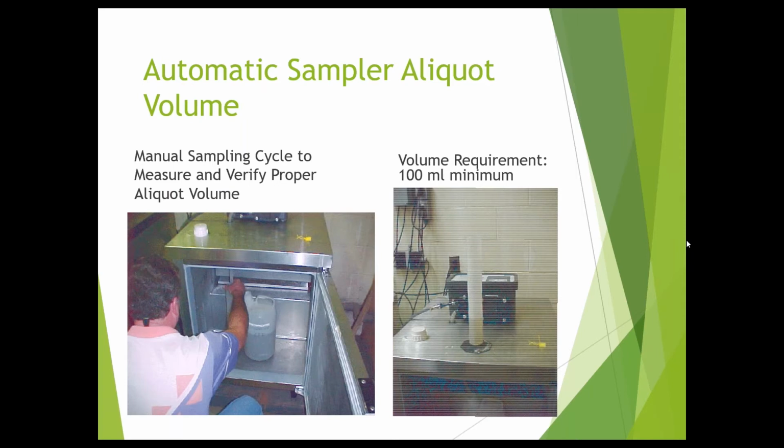And so here, we want to make sure our aliquot volume is the same. So again, that 100 milliliters that you see on the right refers to a peristaltic pump. Remember, its sweet spot is really greater than 100. That's where it's the most accurate. It'll do greater than 50, but it's really accurate when it's greater than 100. And over my 8 years of sampling, I find even at 100, it's plus or minus 5 mils.